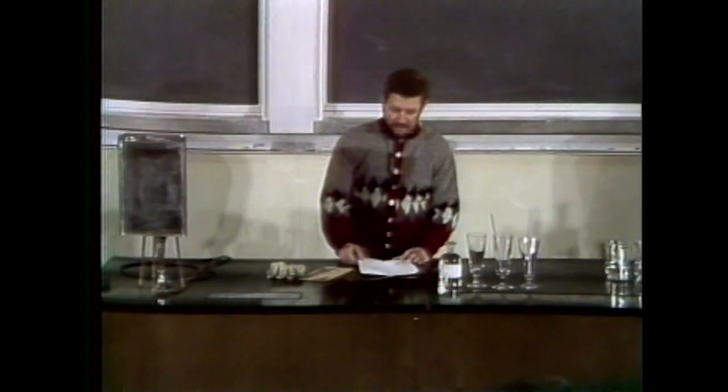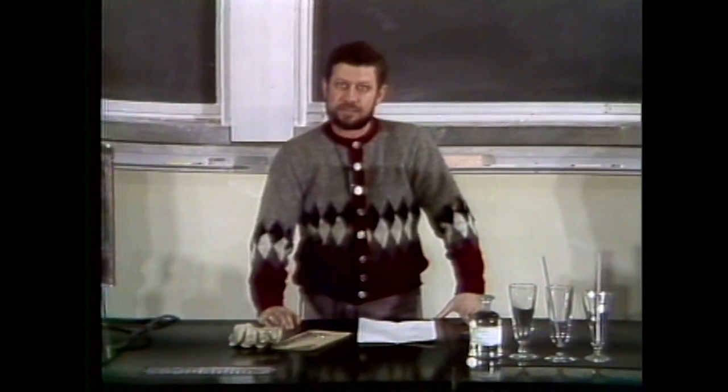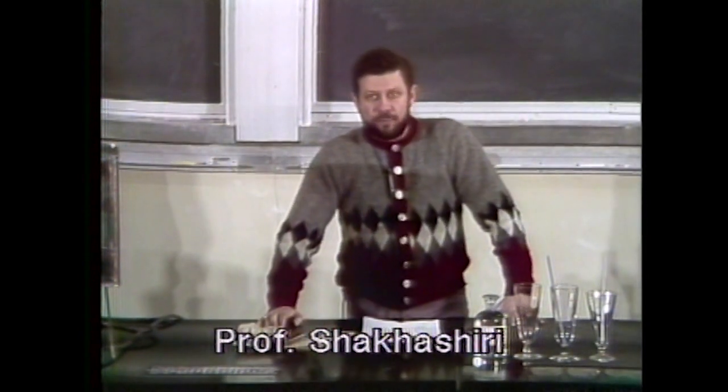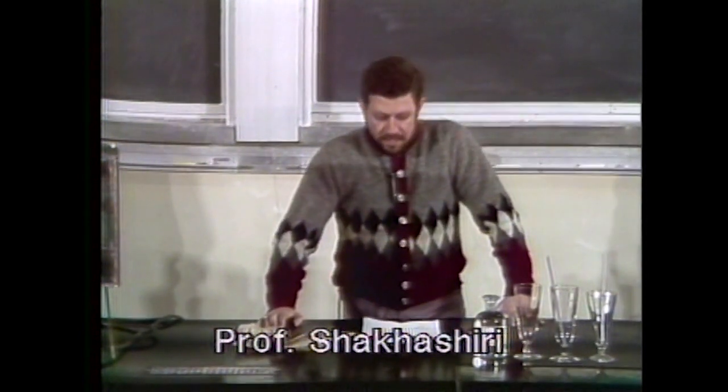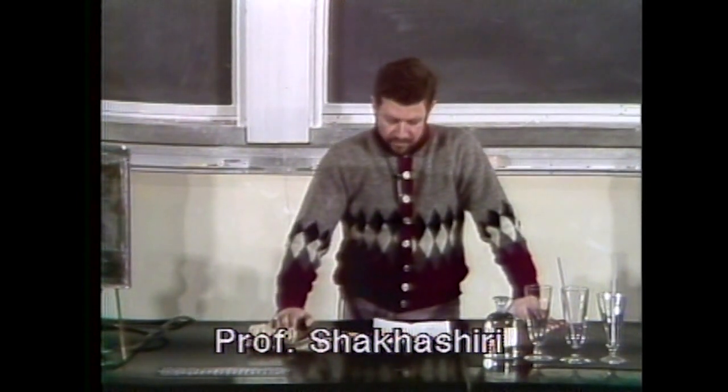As you know, the last lecture in Chemistry 103 is traditionally set aside to do a series of demonstrations, hopefully illustrating a number of the concepts and phenomena that we have dealt with this semester.